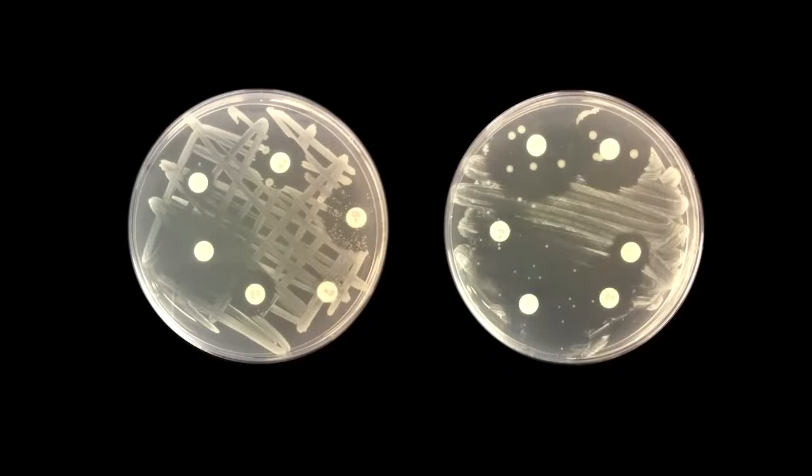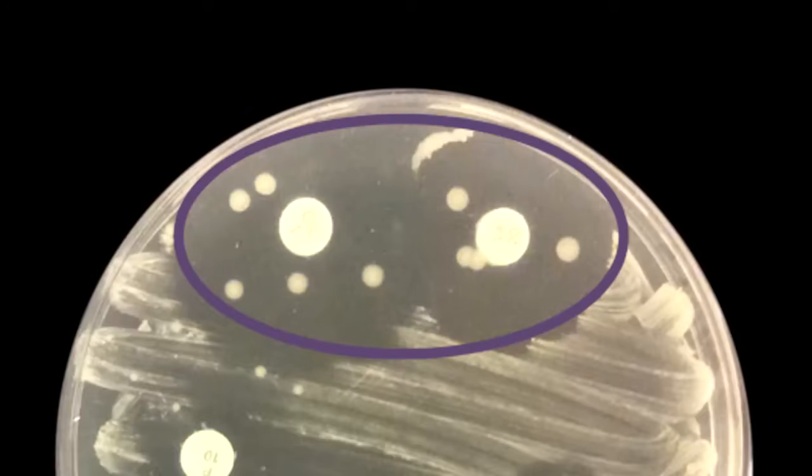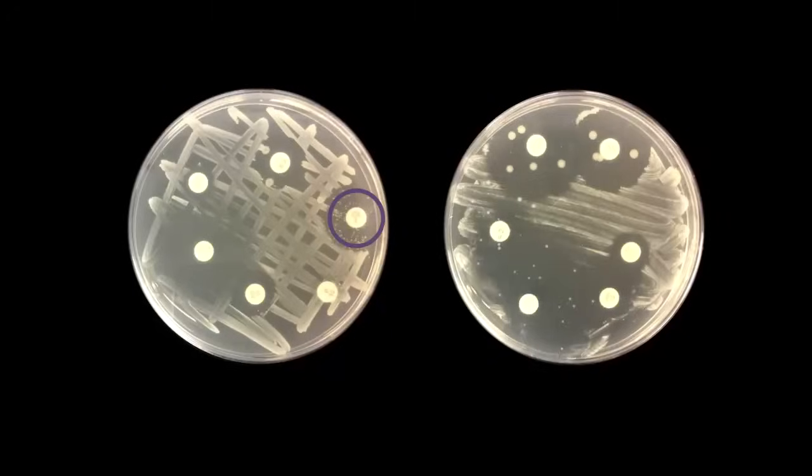Let's take a look at these students' plates. Do you see anything interesting? What can you tell me about these colonies? They are resistant to the antibiotic. And how did they get there?